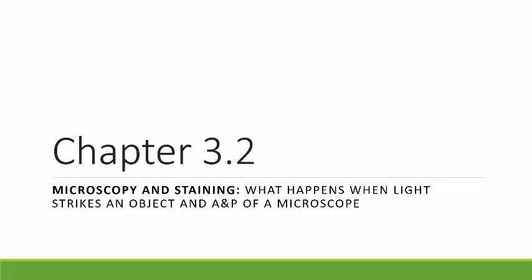With this video, we're going to try to make a little bit of sense about what happens when light strikes an object. So some of the things that occur as we work to try to explain what's going on inside a microscope and how to mitigate some of the issues related to light microscopy.